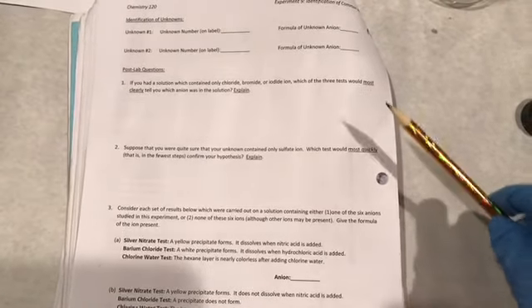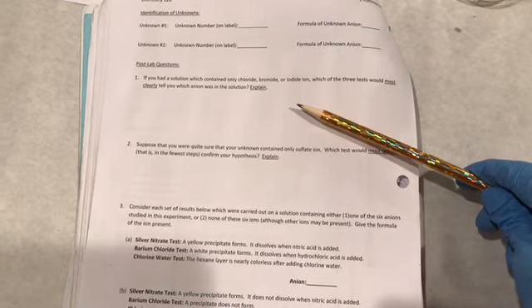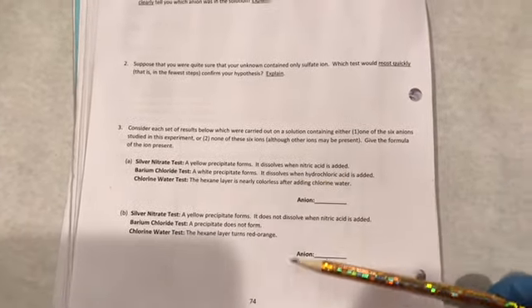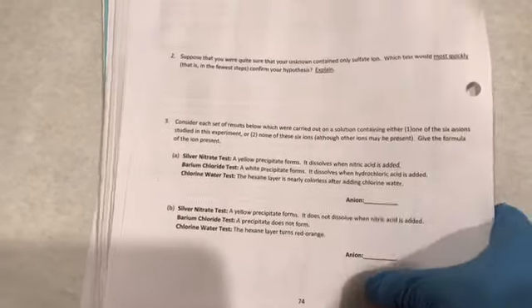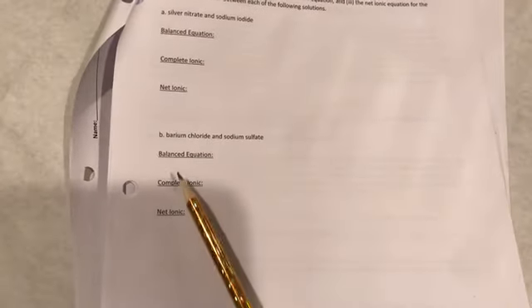After figuring out your unknowns, make sure you finish your report sheet by writing all of your answers here, post-lab questions, and you try to answer these questions as well. And then on this next page, you are going to write the balanced chemical equations, ionic equations, and net ionic equations between silver nitrate and sodium iodide, barium chloride and sodium sulfate, the way we learned in the lecture.